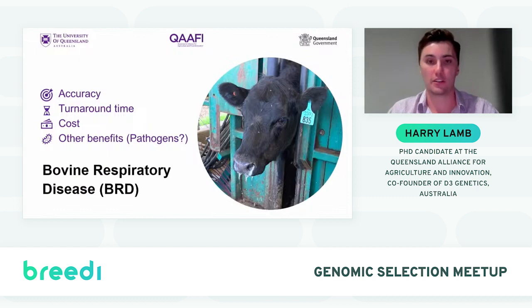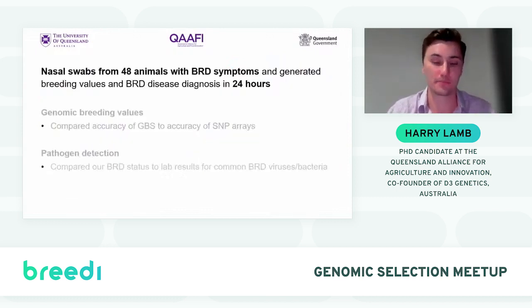And so for this particular study or set of results that I'm sort of talking through today, what we were interested in was if we could detect bovine respiratory disease at the same time as calculating breeding values. Bovine respiratory disease is quite a complex disease. And it's caused by a number of different pathogens, but it causes that really snotty and mucousy look you can see in cattle, all that discharge from the nose, and it also causes a fever. And it's quite an issue in large-scale feedlots. Next slide, please.